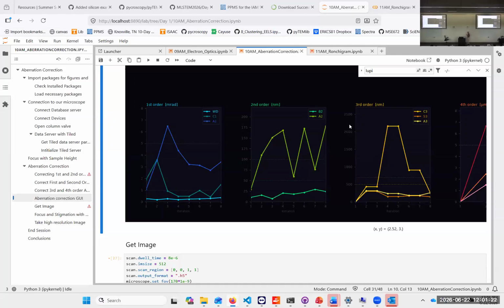There is the stigmator from the corrector, and the stigmator, a fine astigmatism corrector as well. So you basically have three different parts that you do, and you can actually make it worse by changing the wrong corrector. So what you should do is you change the condenser.